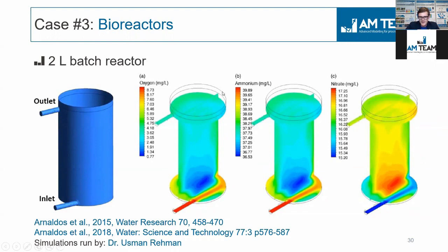These color gradients show the local concentrations of certain species—in this case, oxygen, dissolved oxygen, ammonium, and nitrates. You can visualize all kinds of things, but the message here is if you look at a two-liter bioreactor, you already have significant gradients.